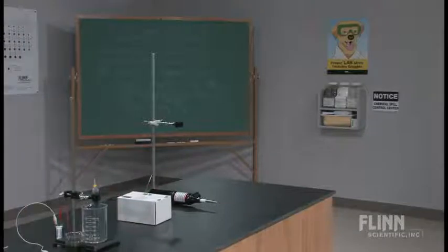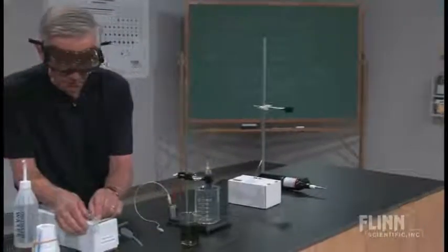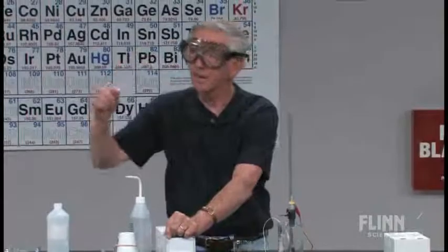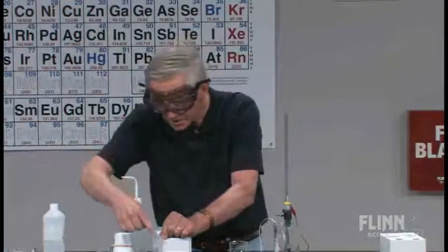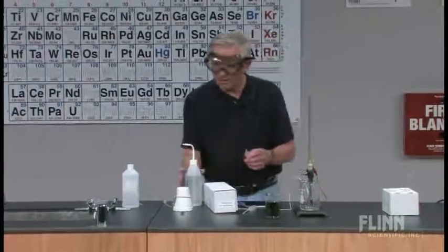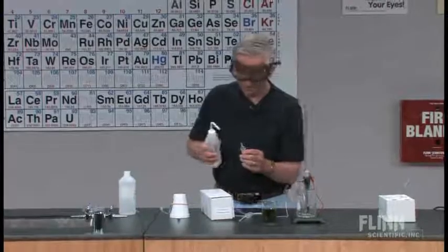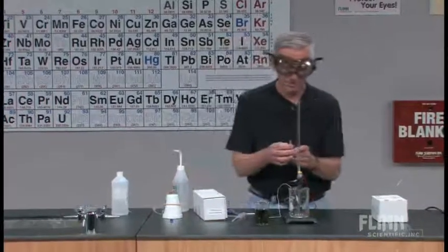I have taken a bulb just like the one that's over there somewhere. This time I've put a little piece of copper wire in each side. There's a gap of a millimeter or so, not really critical. Hot melt glue seals where I put the wire in. We're going to do the same thing, but a little bit differently. So I'll get this going. In some ways, this is even more satisfying.